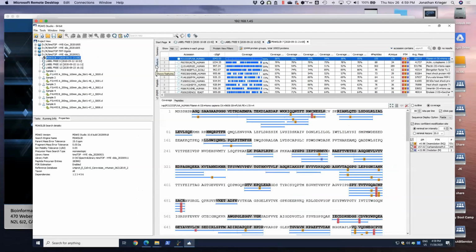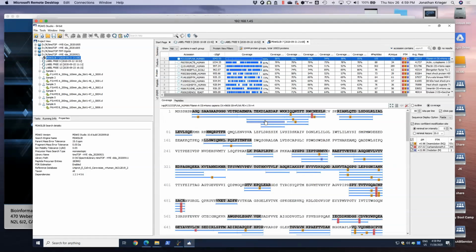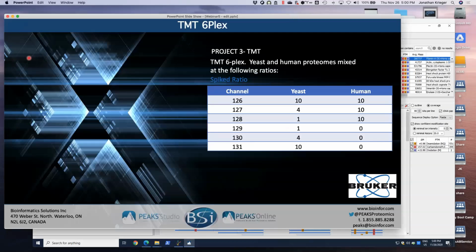This is our library search that I wouldn't open before, but now, of course, that the webinar is over, is opening. And I won't spend too much time on showing it to you because we showed it online, but essentially they look the same. And I'm happy to send the project to you if you need it, and we hope to upload it as a demo project.